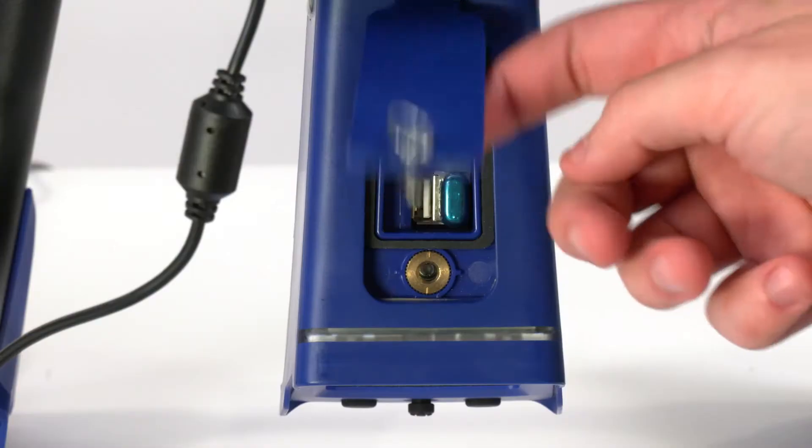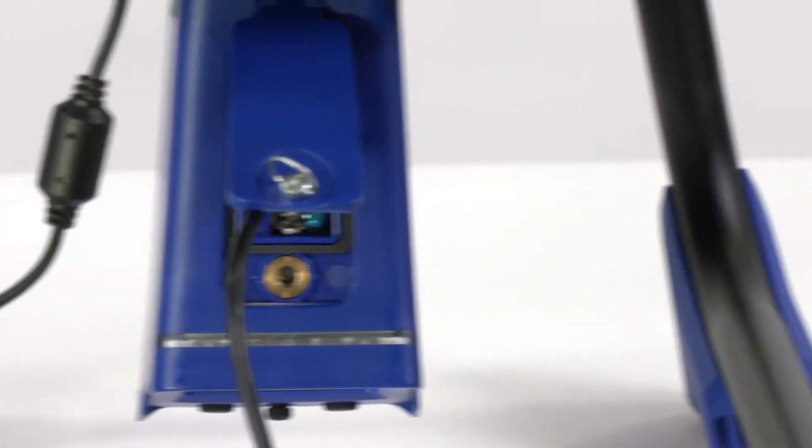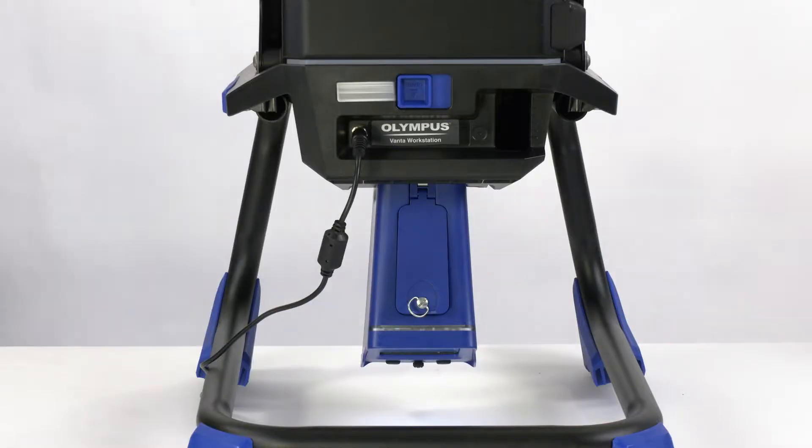Connect the Vanta analyzer to the PC software via the USB port or wirelessly via the Vanta mobile app to transfer data or control the analyzer.